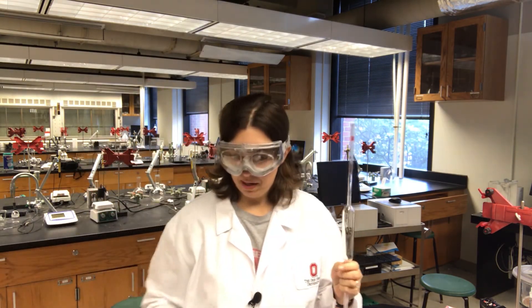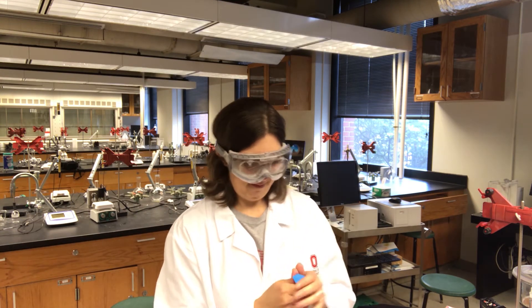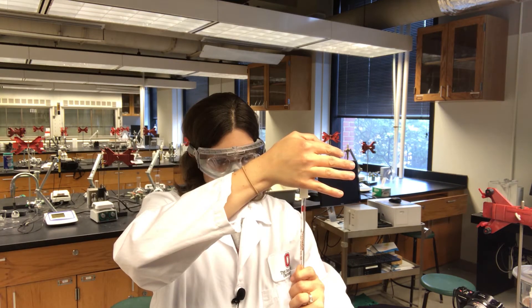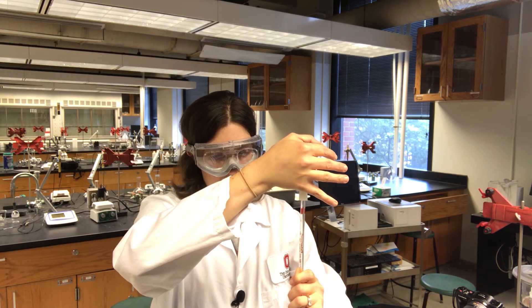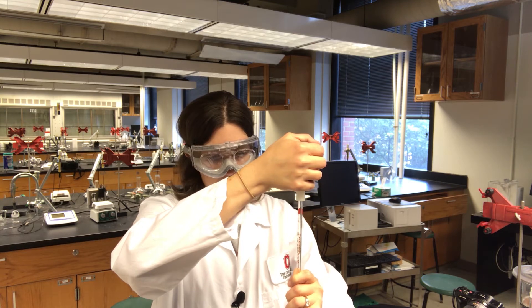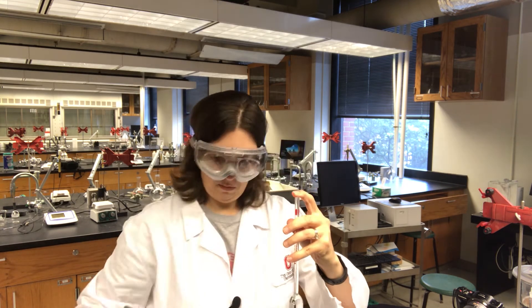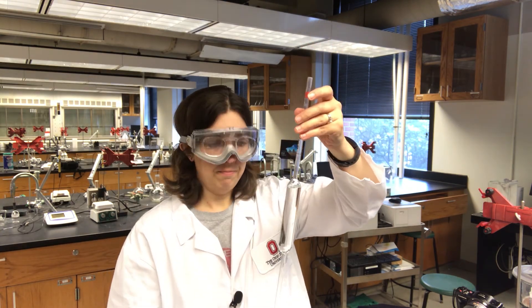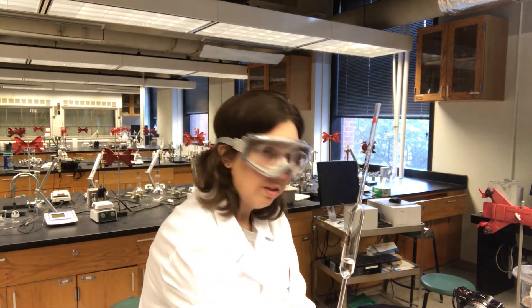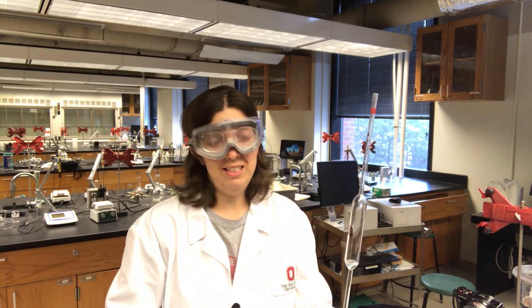I've got my 50 milliliter pipette. I'm pipetting 50 milliliters of the solution I just prepared into another 100 milliliter volumetric flask. It's a good idea to make sure you're labeling your flasks in some way — it's really easy to get these mixed up.